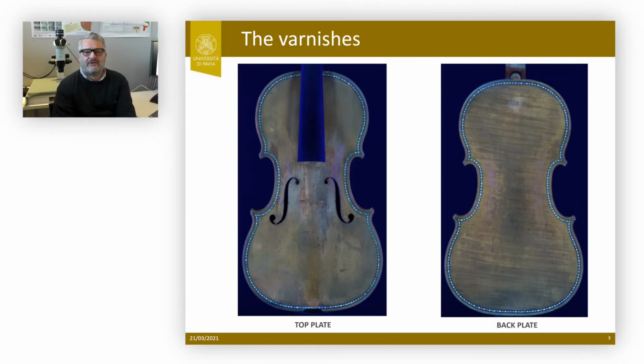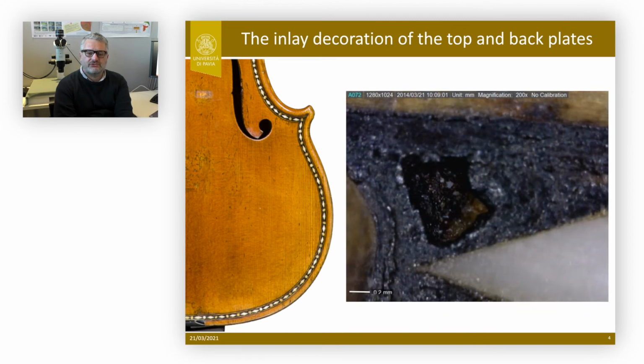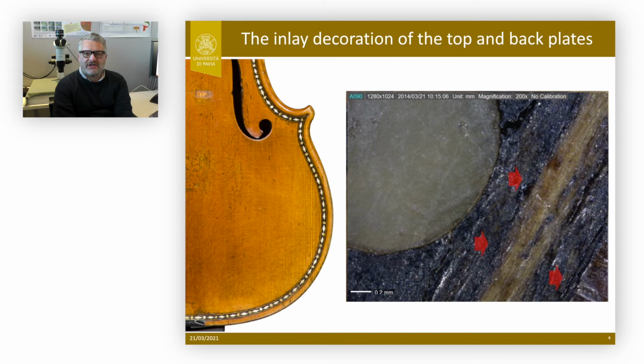The analysis of the varnishes was performed both in the area where the varnishes are well preserved, and in the area where the varnish was worn out because of the playing of the instrument, because of the contact of the player. It's important to separate the results that we can obtain by ELIO and to try to attribute the elements either to the wood or to the varnish layers. By stereomicroscopy, it was important to analyze and study the morphology of the inlays and purflings, just to compare those results with all the other results that we have in our database.